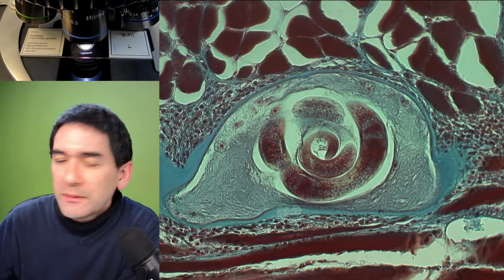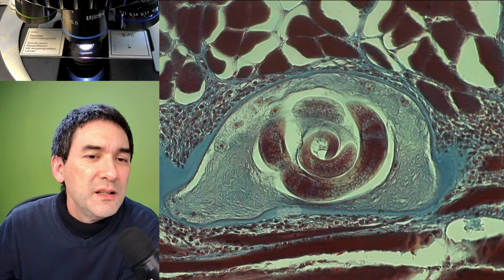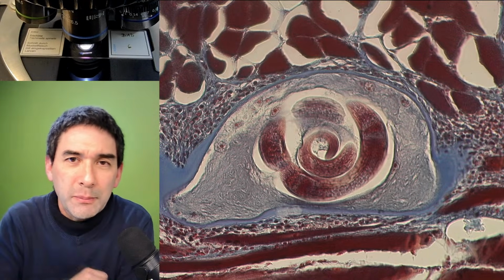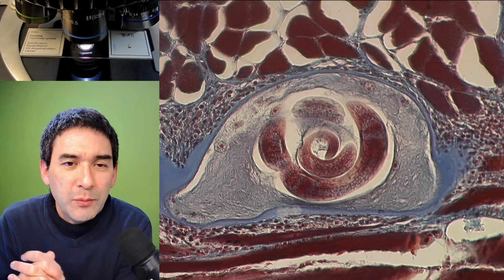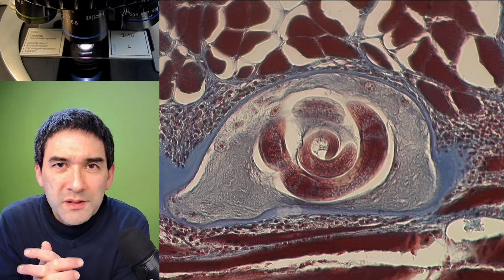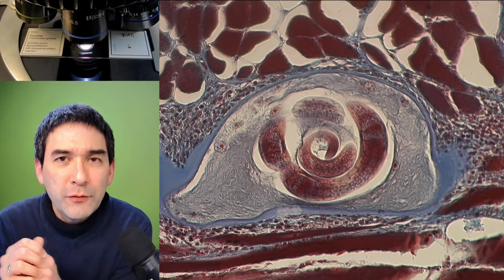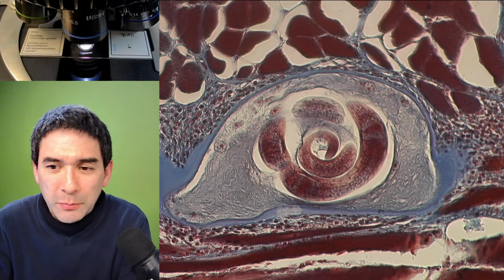Okay, so with the DIC, I'm a little bit limited here. So what you see over here is this round thing. That's actually a worm that's spiraled up inside the muscle. So what happens is that when you eat contaminated meat, those worms spread over the blood, and then they go into your muscle, and they make those cysts in there. And if you've got a lot of those, then this can actually be a problem. Then you can't move properly anymore.